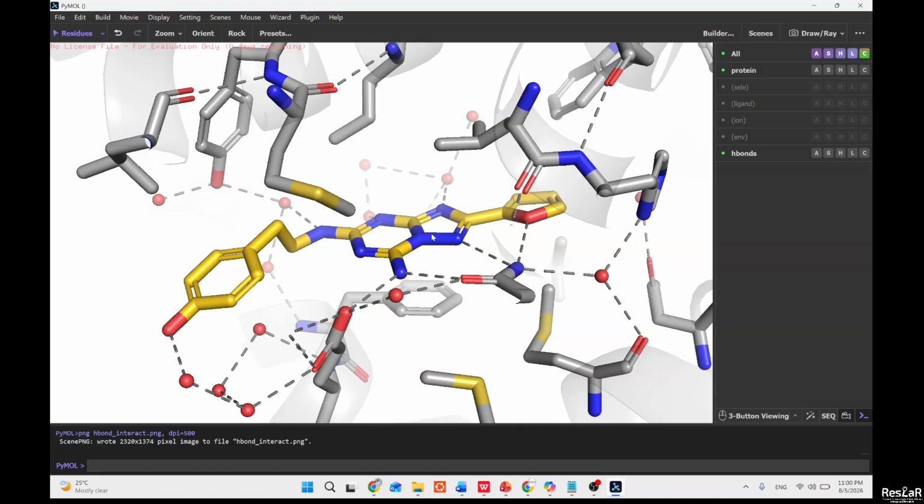Whether you're working with a protein alone or whatever, you see it and generate the code, I mean, the script on how to use it, and once you run it, it's like magic and it happens. There are many more scripts, maybe, but I'm going to make this particular script available in the module so that you can also run and reproduce the same thing.